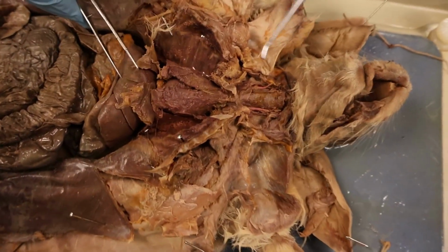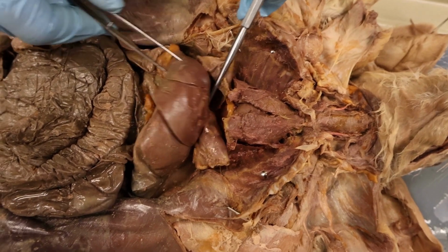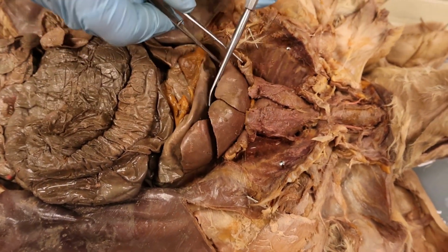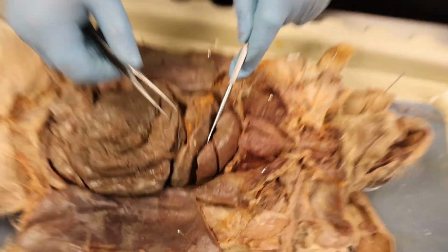Alright, from this esophagus we're going to go down through, we're going to make a pit stop at the liver. This liver is going to filter out toxins throughout the body and generally help extracting nutrients from waste.